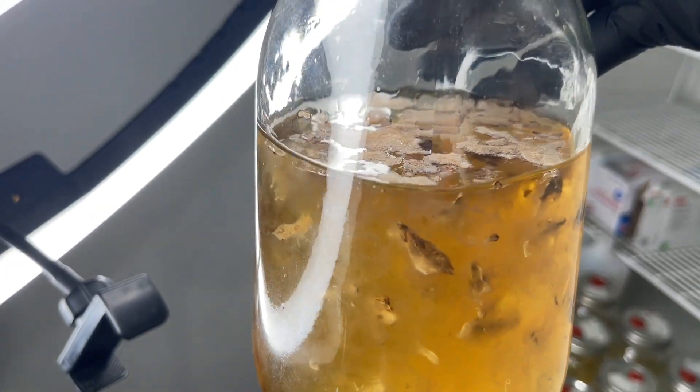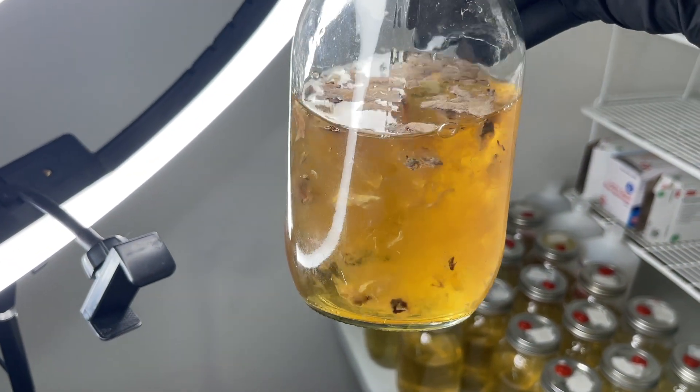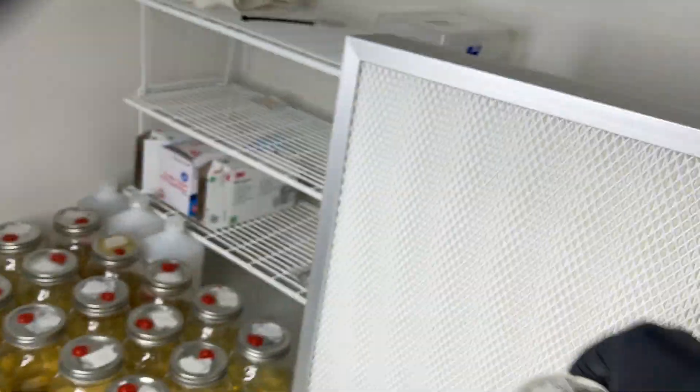My first example is black poplar pioppino mushroom. If you don't stir the liquid culture every couple days, the mycelium will grow on the surface and start turning brown.